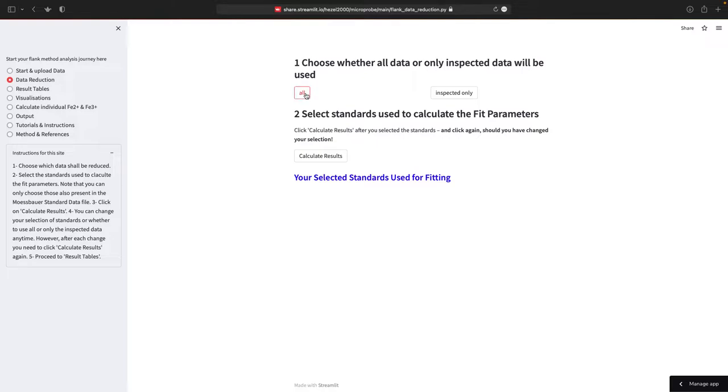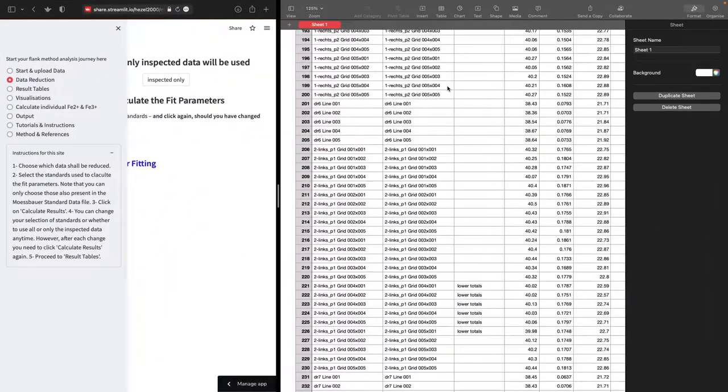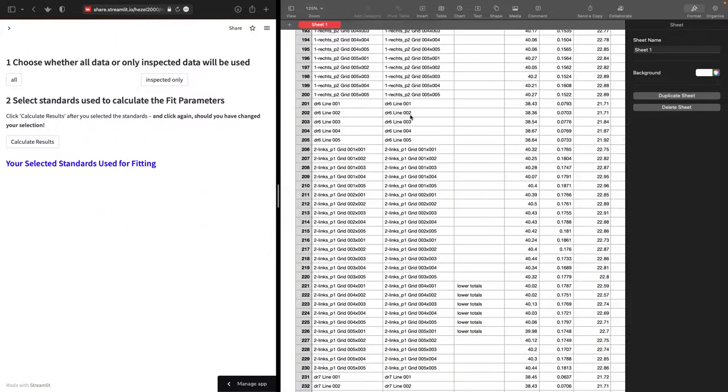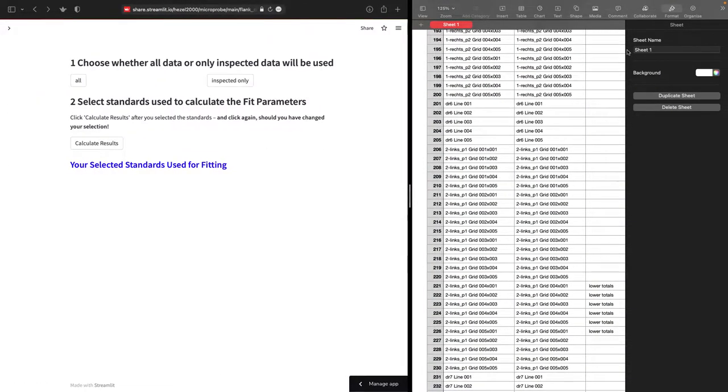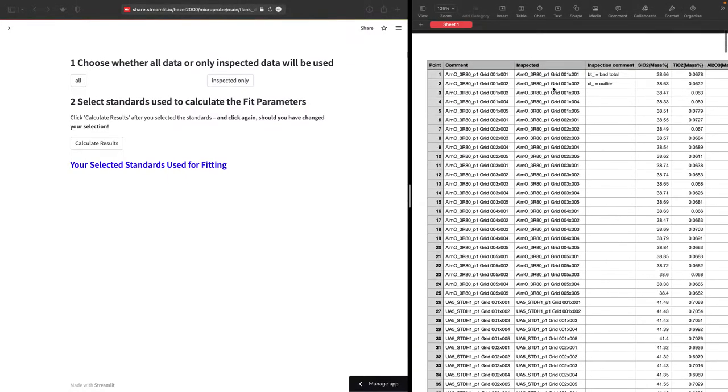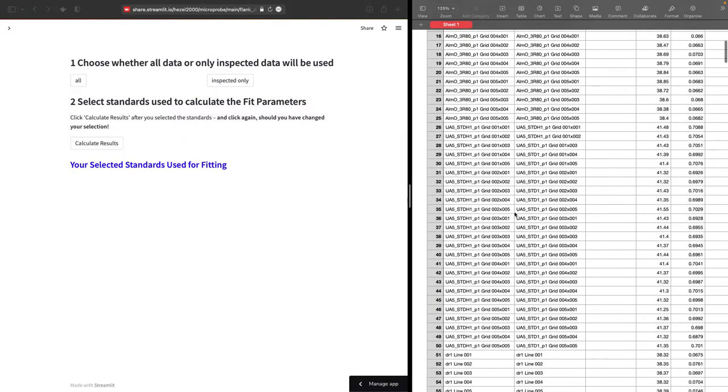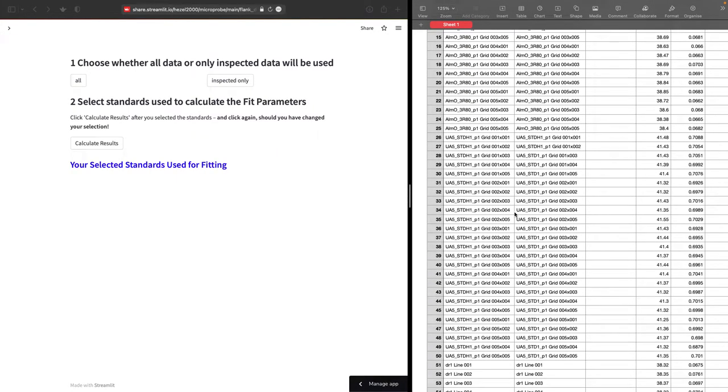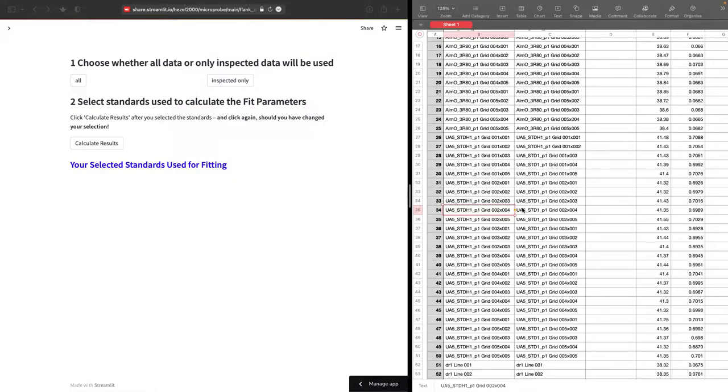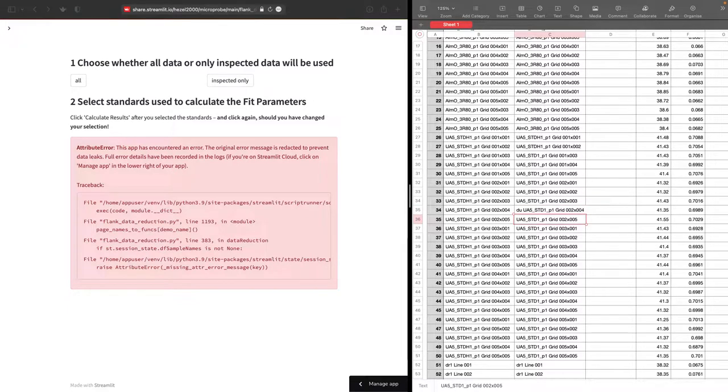Now you can either choose all data or only the inspected data. So these are those in the second column. So if this is your data here, for example, then here's your inspected column. And the inspected column, maybe there's a problem with one sample. And you don't want to include this in your analysis. Then you can simply rename this with whatever - don't use, for example. And this is it.